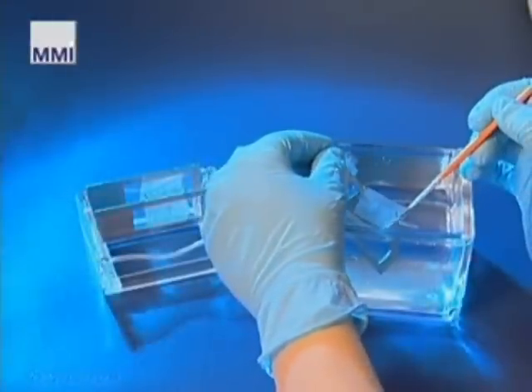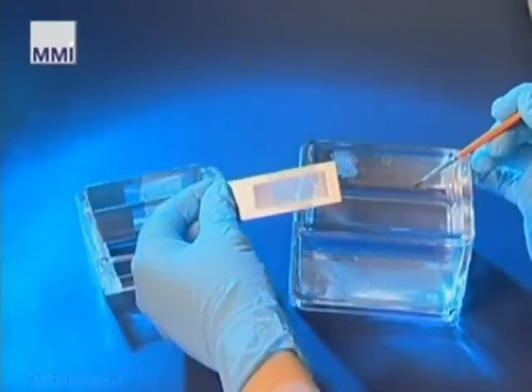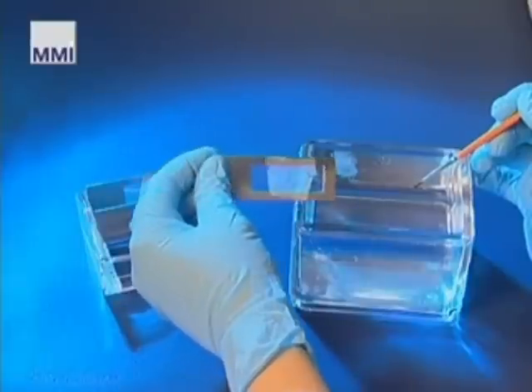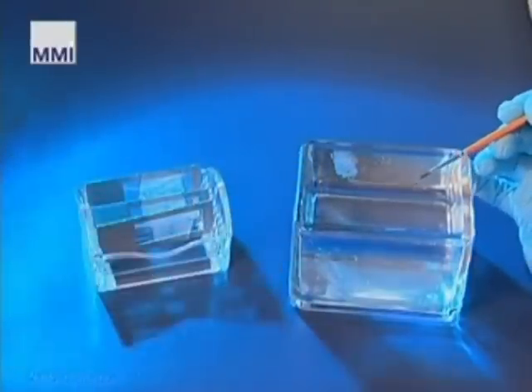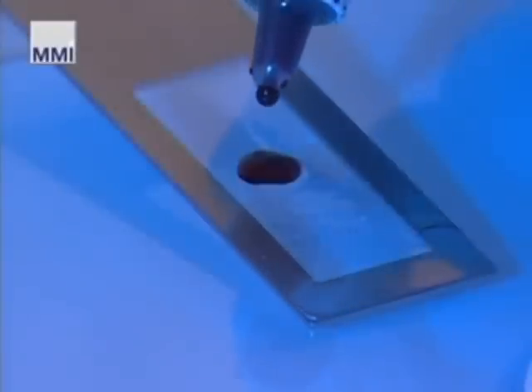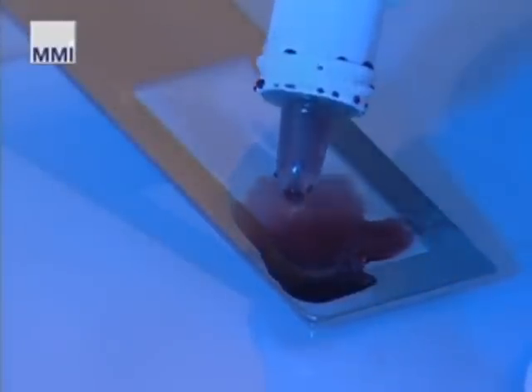All your paraffin, cryo samples, smears, and even cell cultures can be used. The specimens are placed on a special holder covered by a membrane. This procedure and the subsequent treatment of paraffin removal or coloring is the same as used with routine slides.